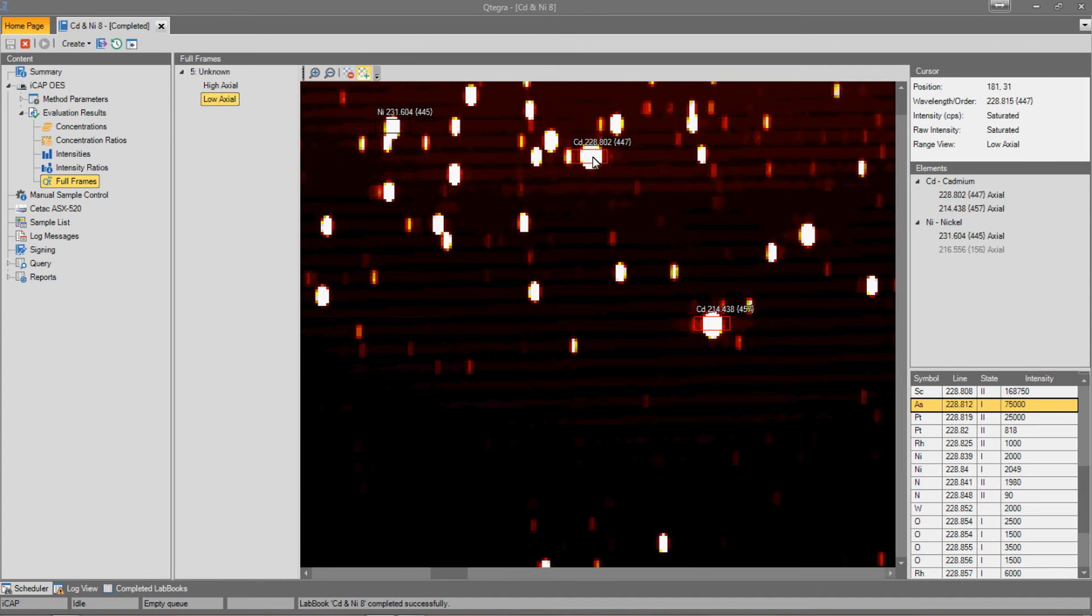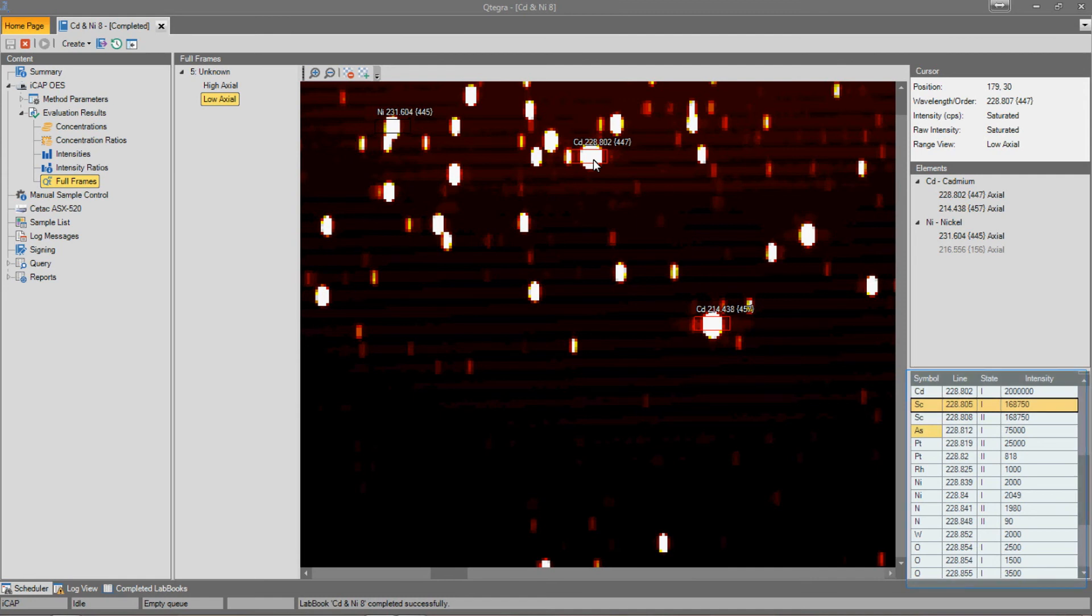To verify what is causing the interference on this cadmium line, we can click on the peak and a list of potential interferences based on the wavelength database is shown on the right.